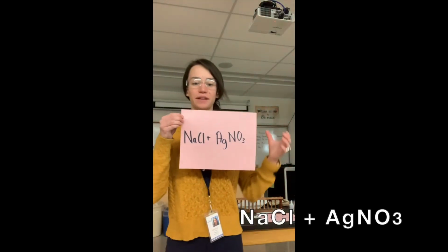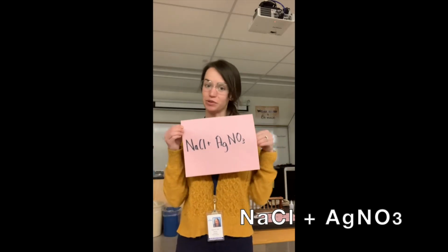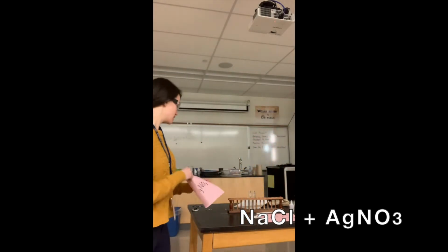Alright, here's the next one. So we're going to be taking some NaCl and AgNO3 and mixing them together and observing what happens.